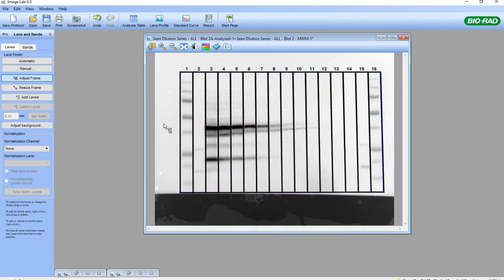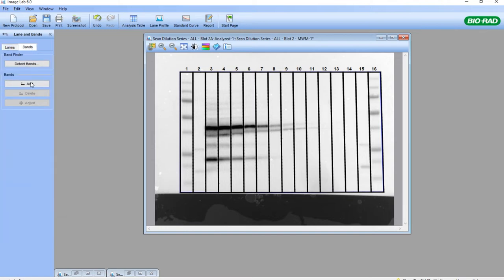Now I have my bands inside the lanes. The next step is using the Band Tool to add bands. I'm not actually adding bands — I'm just telling the software where the markers are and where the bands of interest are that I'd like to do molecular weight analysis for.